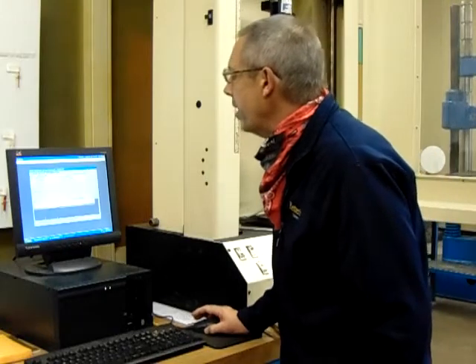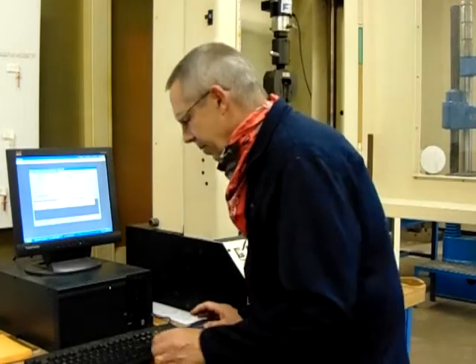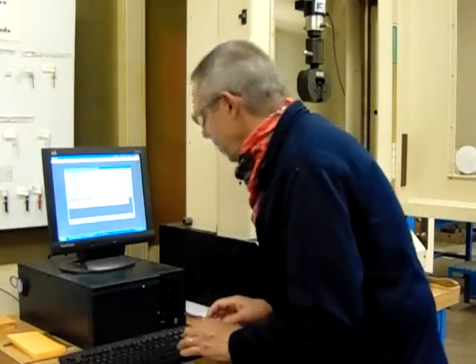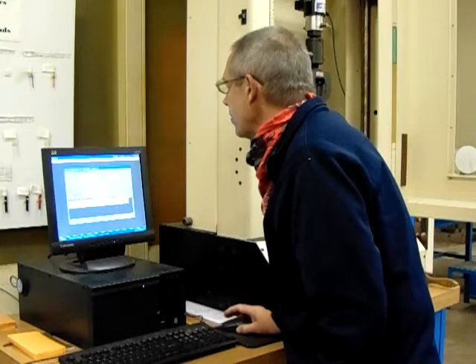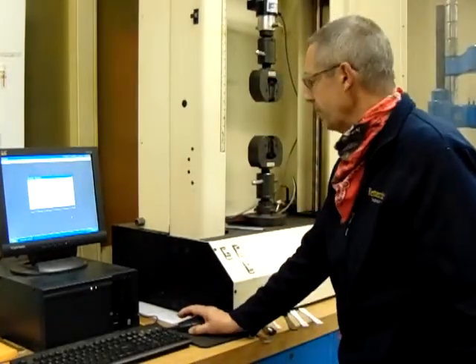We're going to click on the OK button. We're going to put a couple dimensions in here: the width of 0.5, thickness of an eighth of an inch. And then we're going to go to tensile testing of the specimen.